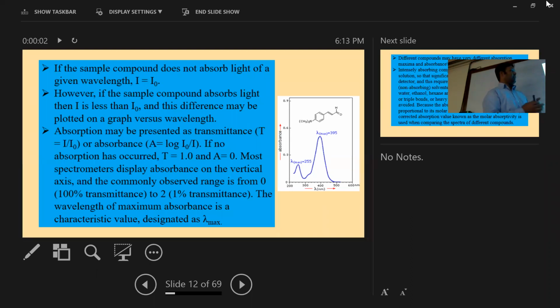But if we take the image from the SEM or TEM, then we can find out the size of the nanoparticle, and not only size but also shape and pattern, everything, using that type of instrument. So first we see in the UV-visible spectrophotometer that lambda max is around 520 nanometer, and then we take the image from SEM and TEM, and we can confirm that our gold nanoparticle size is 10 nanometer or 12 nanometer like this.